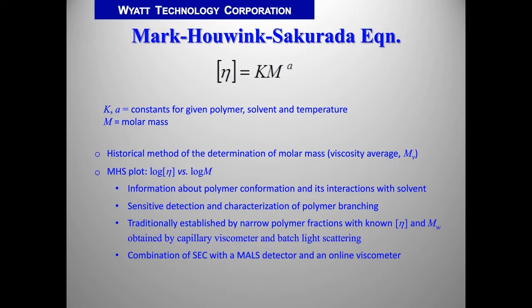And if this equation is expressed in graphical form, that means we plot intrinsic viscosity against molar mass in double logarithmic scale, we get the Mark-Houwink-Sakurada plot. And this plot bears information about polymer conformation, about thermodynamic quality of the solvent. It is also very sensitive to polymer branching.